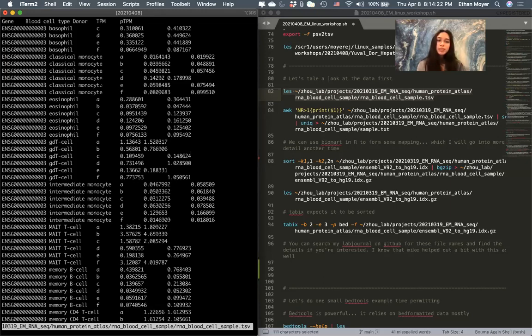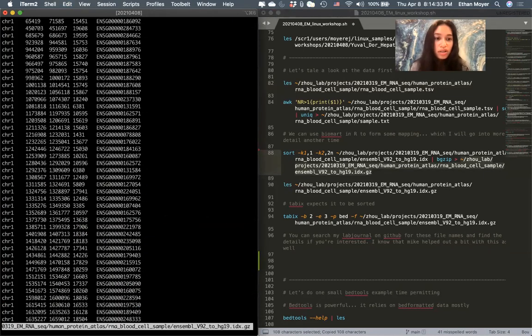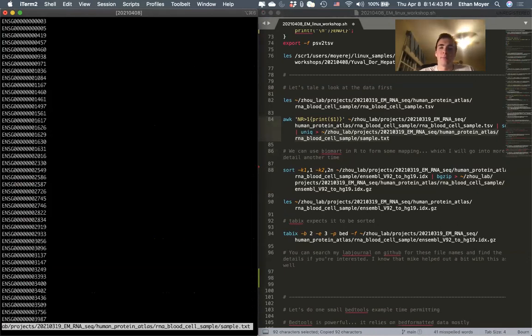And then in the other one, there were 3 columns in the middle. Did you say those were the start, stop? So right here, do you understand how we got to this point? Yes.